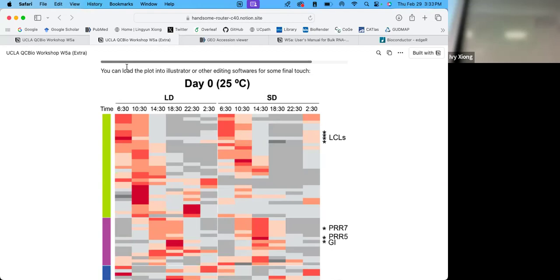Where did you do that? In the terminal? Yeah, the terminal was just the input. GSTA2 was the name of your gene. So that's what you wanted to plug in. If you want to run it in R Studio, that's something you have to input. If it's running on the terminal, that's what I fit in. So you run this script, specify which script you run, and the argument, and input it into the script.